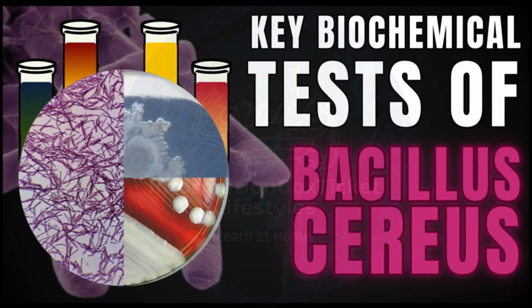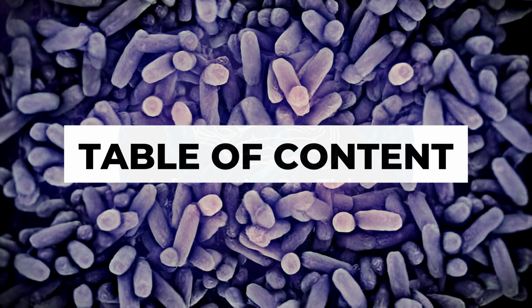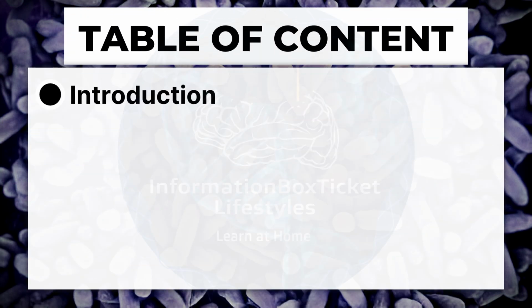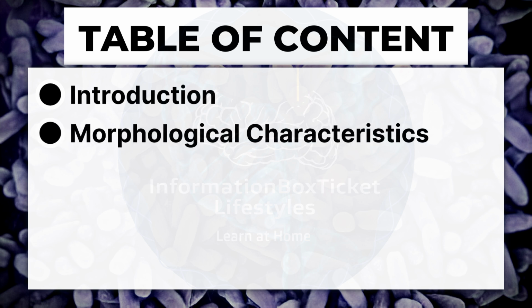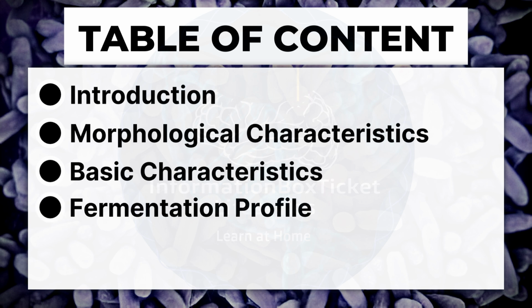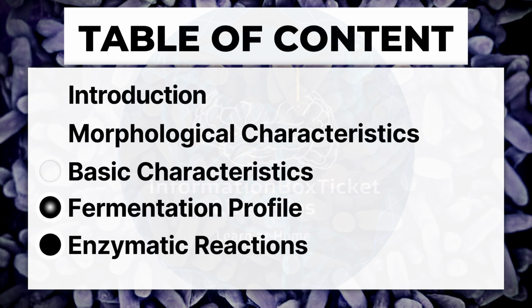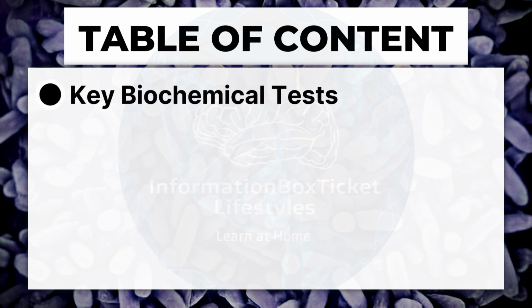Biochemical Tests of Bacillus cereus. Table of Contents. Introduction. Morphological Characteristics. Basic Characteristics. Fermentation Profile. Enzymatic Reactions. Key Biochemical Tests. Conclusion.